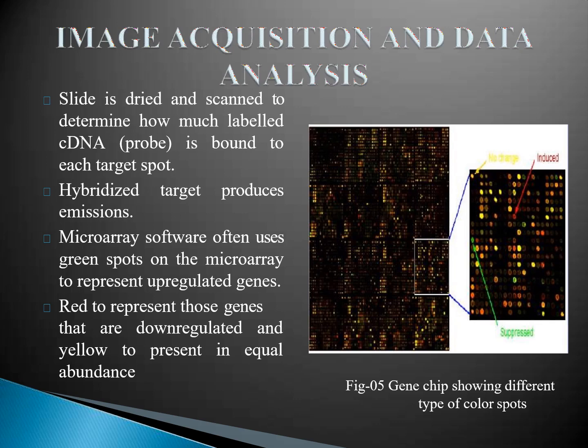Now here you can see three colors, that is yellow, red and green. Remember, the green color dye we use in the control sample, and the red color dye we use in the non-control or the treated sample. Let's suppose that in our example, the control is the normal cell and the non-control is a cancerous cell. So you isolate mRNAs from control, that is from non-cancerous cells or normal cells, and you isolate mRNAs from the cancerous cells. Then you label the cDNA molecules from the control with the green color dye, and you label the cDNA molecules from the cancerous cells with the red color dye.